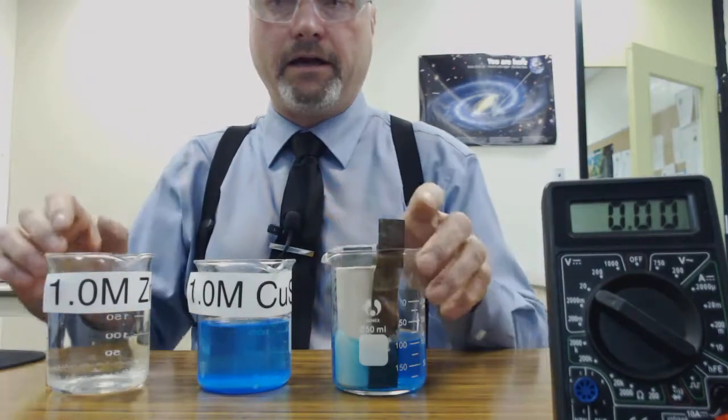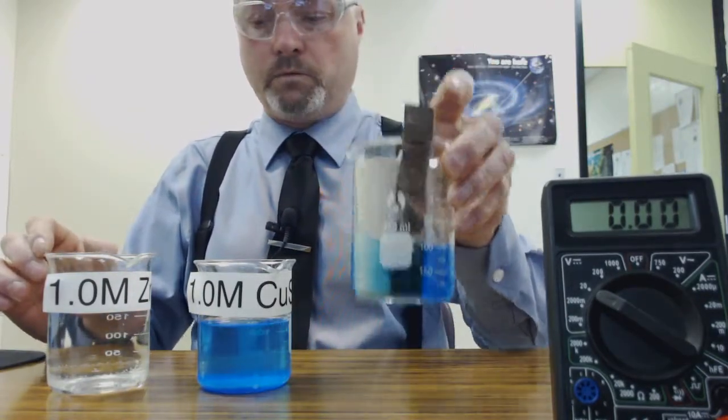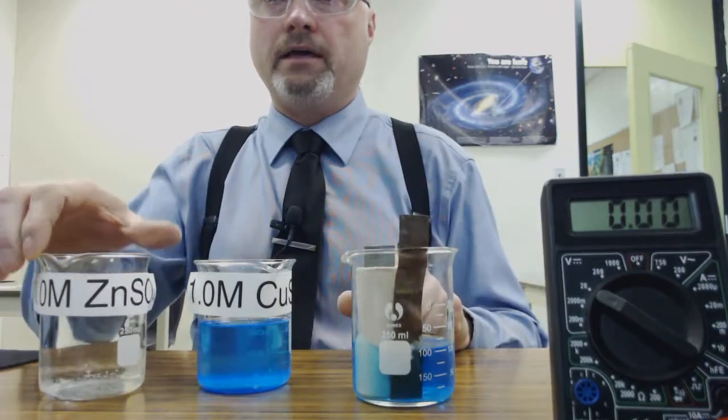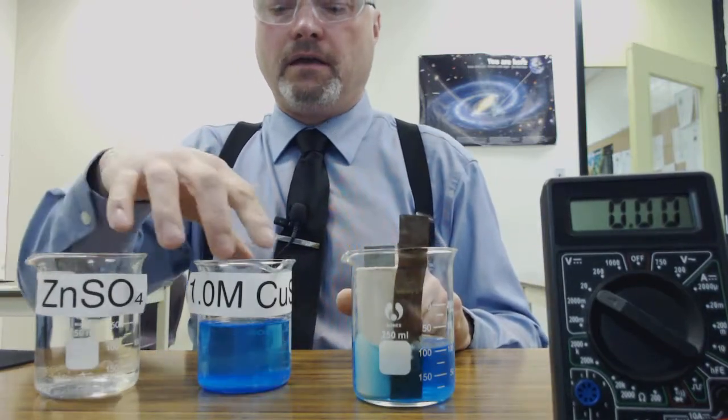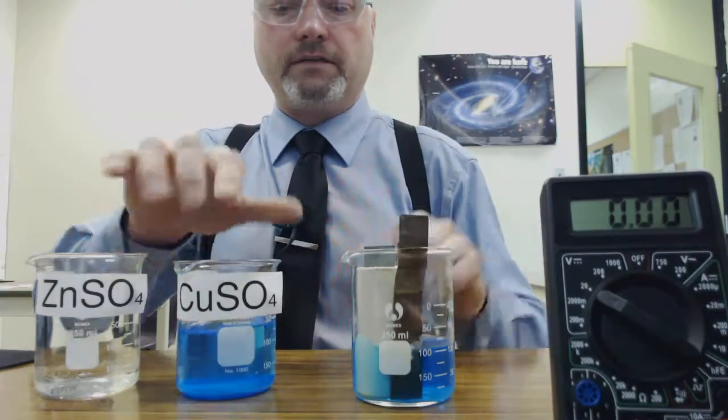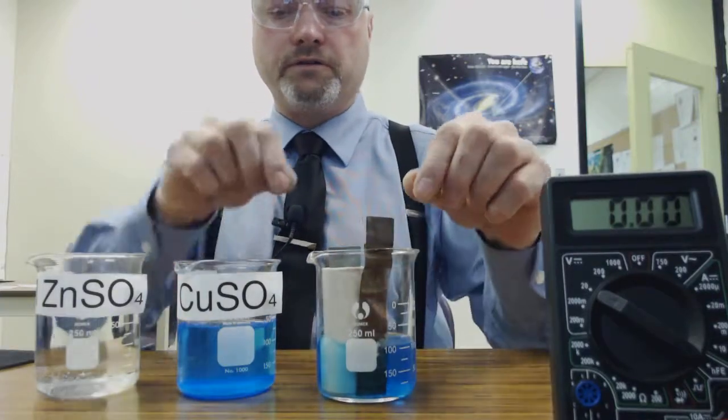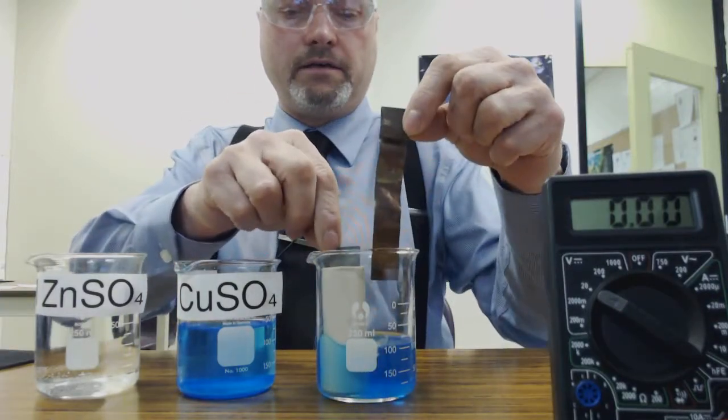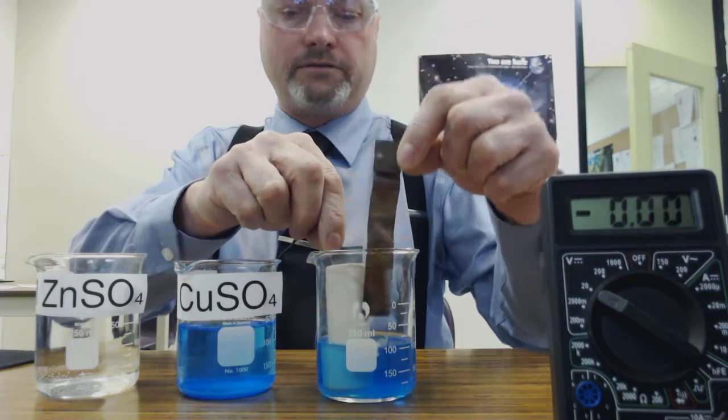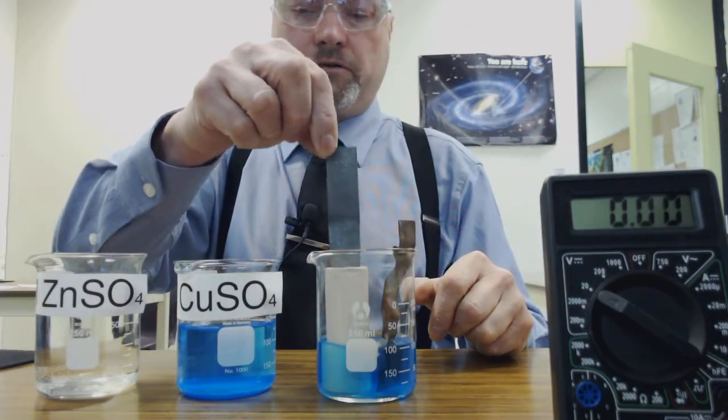And so we have prepared a galvanic cell right here using zinc sulfate and copper sulfate for our solutions, and of course in here is a copper electrode as well as a zinc electrode.